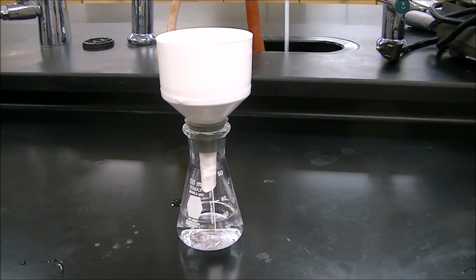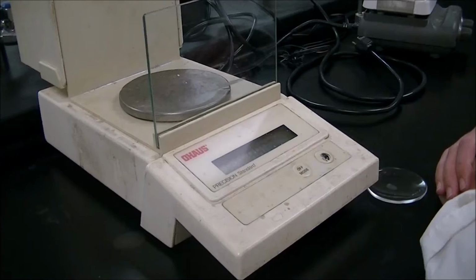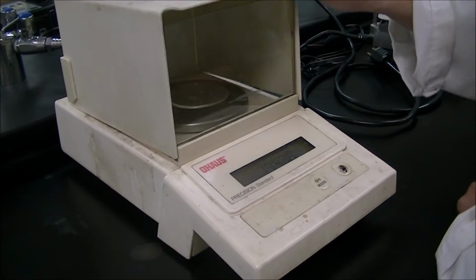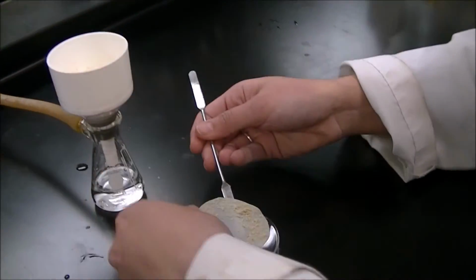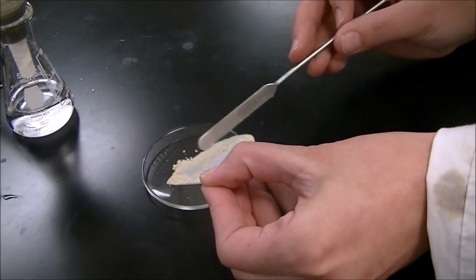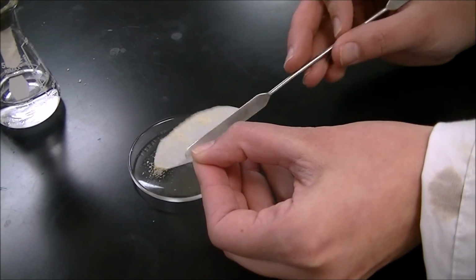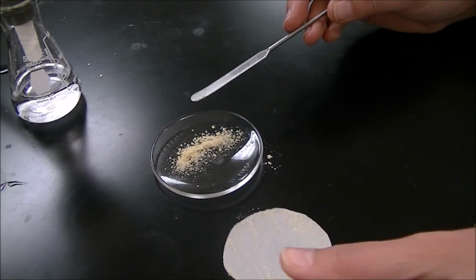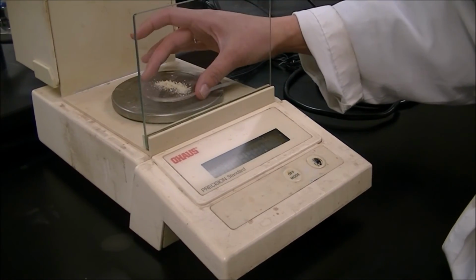Let the filter run for a couple minutes to make sure that you thoroughly dry your product. Weigh a watch glass and record its mass. Remove the filter paper and scrape as much product as you can onto your watch glass. Weigh the watch glass and the product and record its mass.